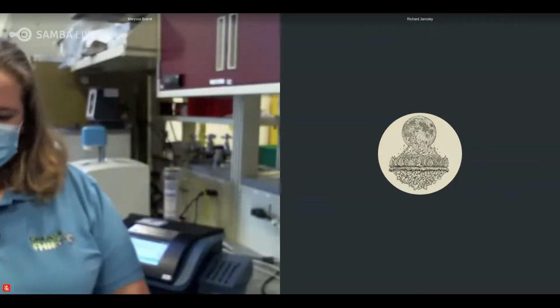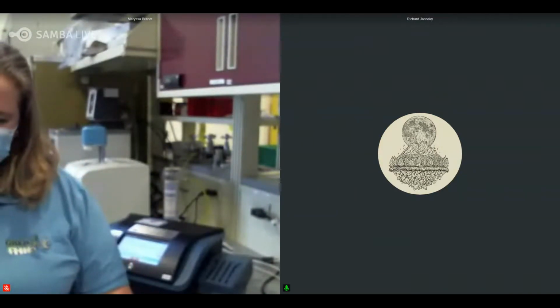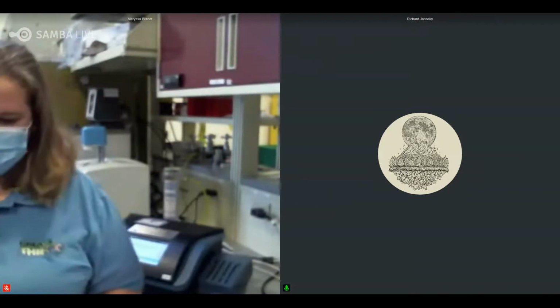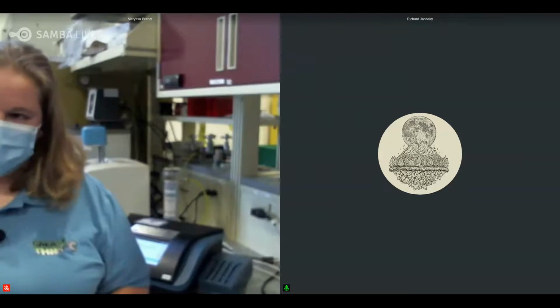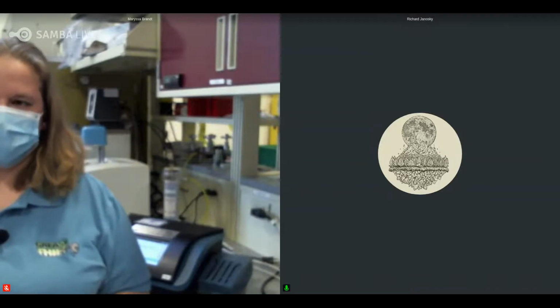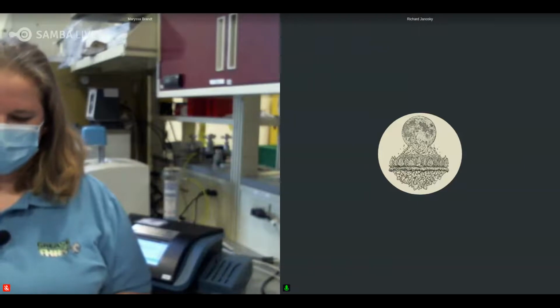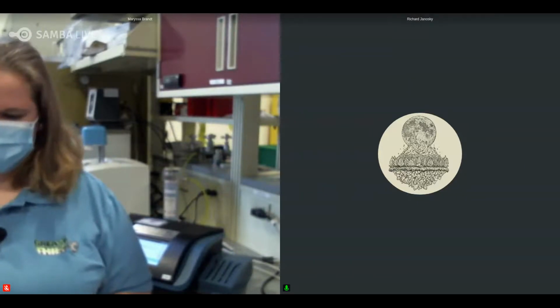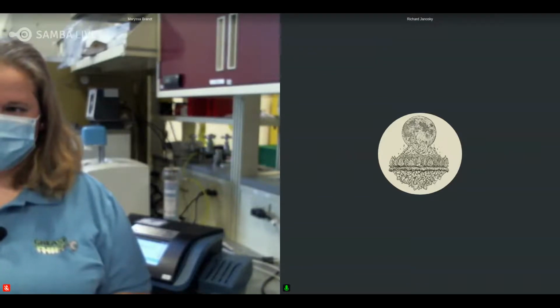That, Rich, would be the advantage of being able to work with people like we have today. We have Doug on from Amatech, Arizona, and they're able to work with you, and they have a lot of experience with any material that could be looked at in the Vapor Pro, and they have different recommendations based on the material type as to if there is going to be a purge, and how long the purge will be. So they're really good at helping people set up a program like that for the material.